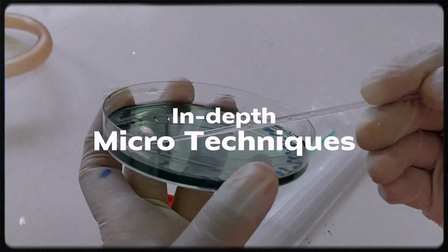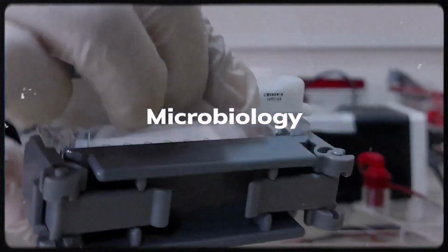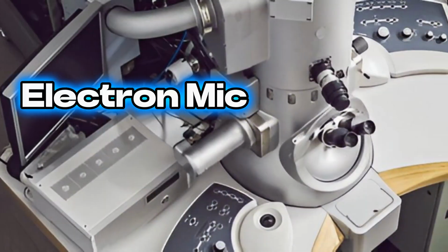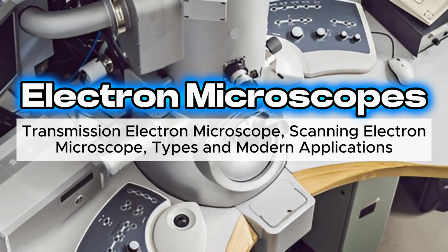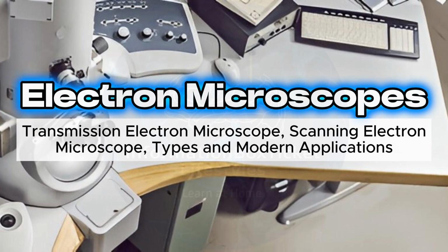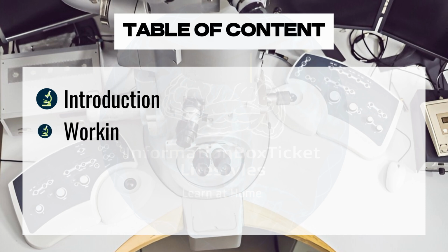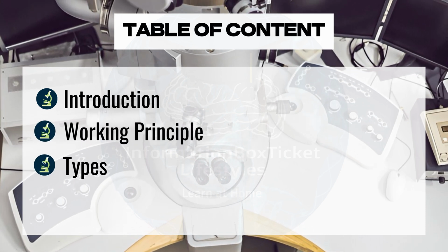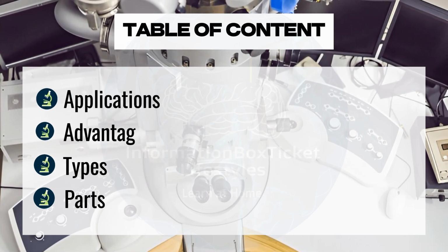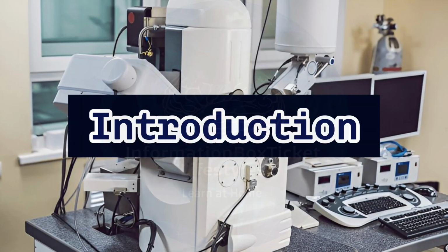Let's explore in-depth micro techniques and uncover groundbreaking insight together on this educational journey into the fascinating realms of microbes. Electron microscopes. Transmission electron microscope, scanning electron microscope, types and modern applications. Table of contents. Introduction. Working principle. Types of electron microscope. Parts of electron microscope. Applications. Advantages. Limitations.